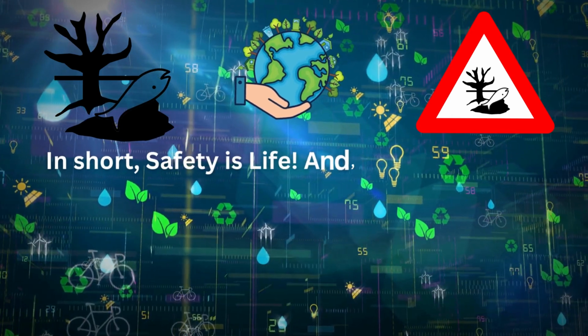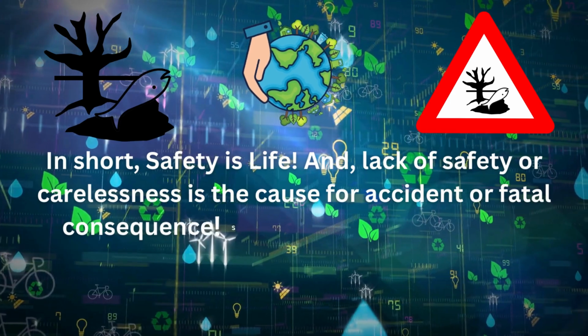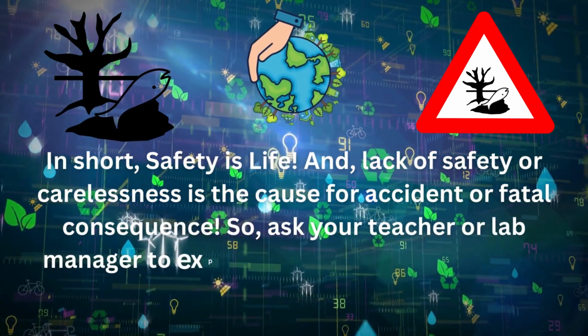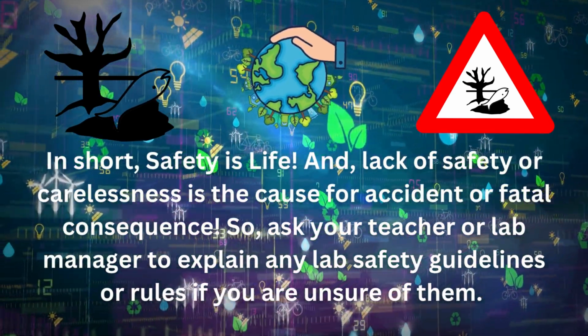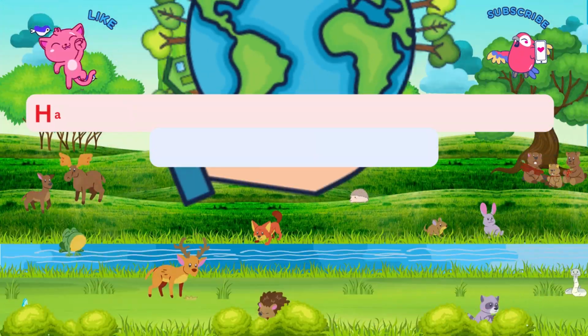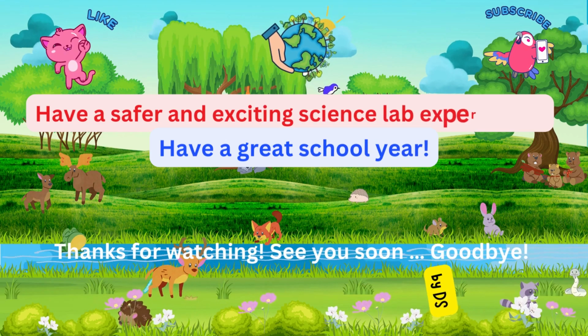In short, safety is life, and lack of safety or carelessness is the cause for accident or fatal consequence. So, ask your teacher or lab manager to explain any lab safety guidelines or rules if you are unsure of them. Have a safer and exciting science lab experience, and have a great school year.